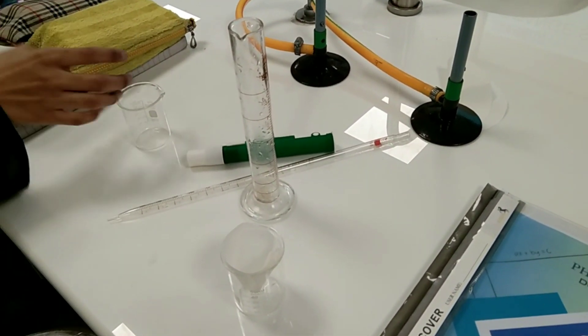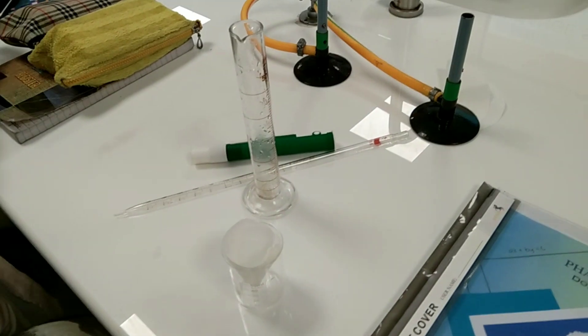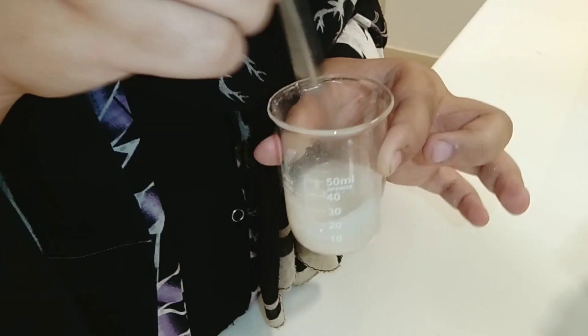After filtering, we will add 16.4 gram of sucrose, as we are preparing 20 ml of orange syrup.